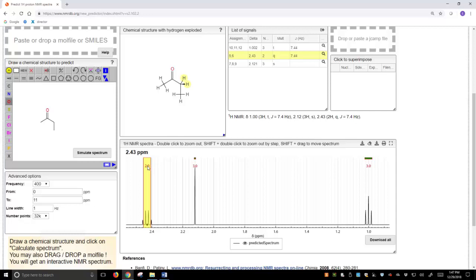Now this doesn't mean this is exactly what the spectrum will look like. This is a prediction tool, but these are pretty high-quality predictions and certainly good enough for us to learn trends in how molecules behave in an NMR spectrometer.